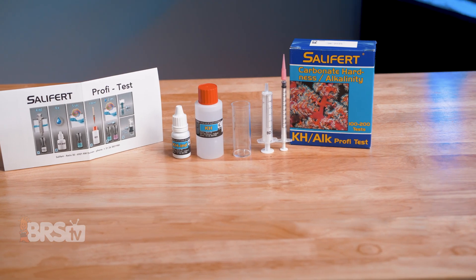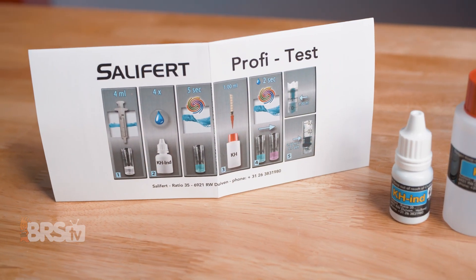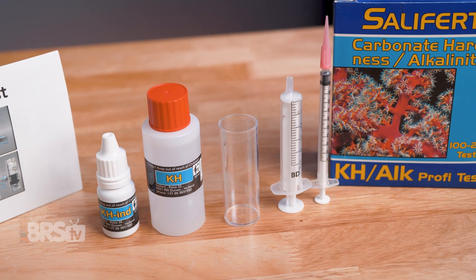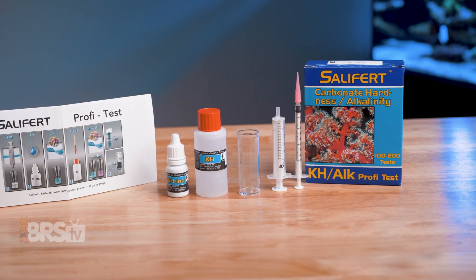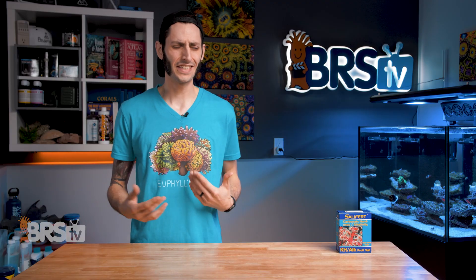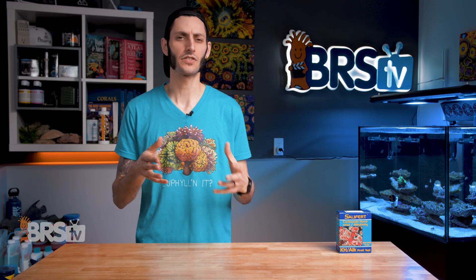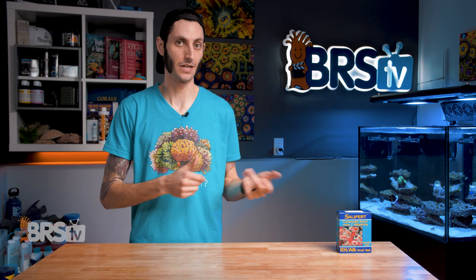Salifert's alkalinity test kit is inexpensive and easy to perform and has been trusted by successful reefers for decades. It can read alkalinity in 0.3 DKH increments, and has no ceiling since you can continue to titrate until you reach the end color. So whether your alkalinity is low, right within the range it's supposed to be, or wildly too high, this test kit is gonna be able to read it.